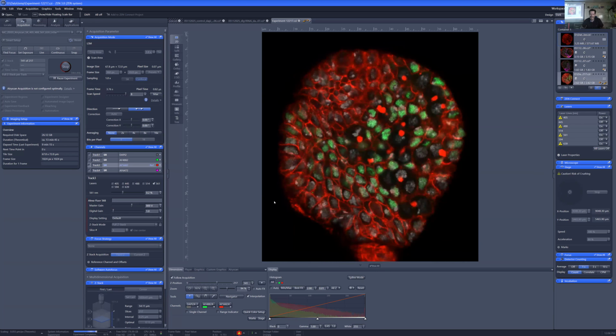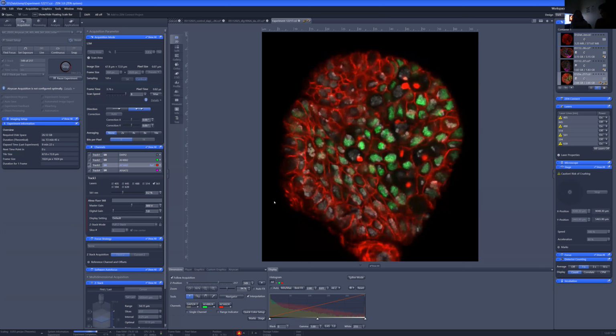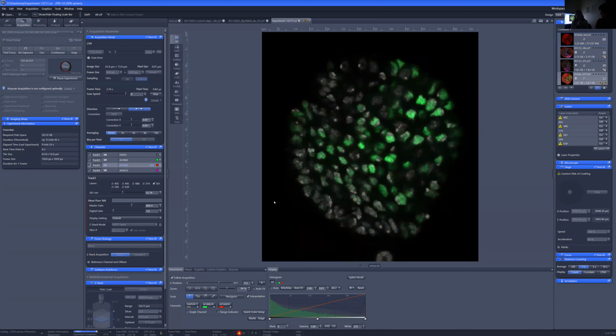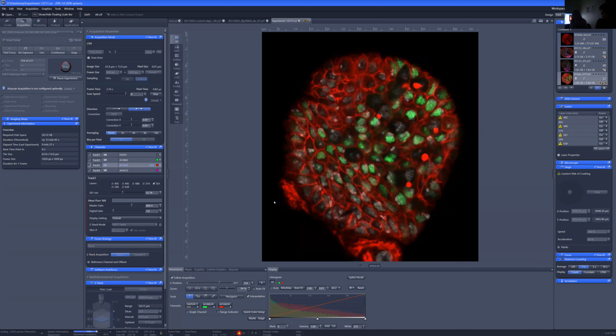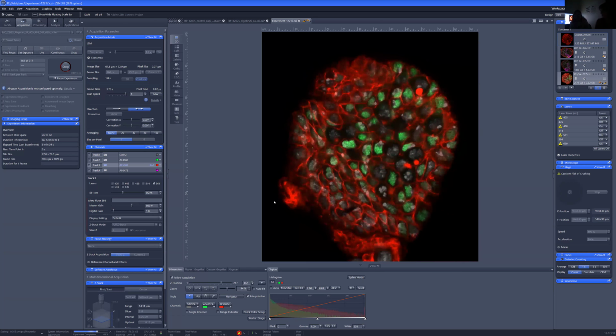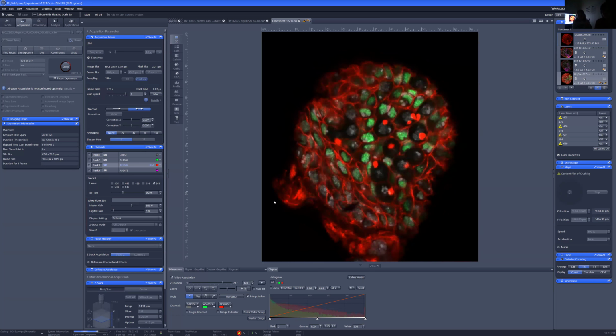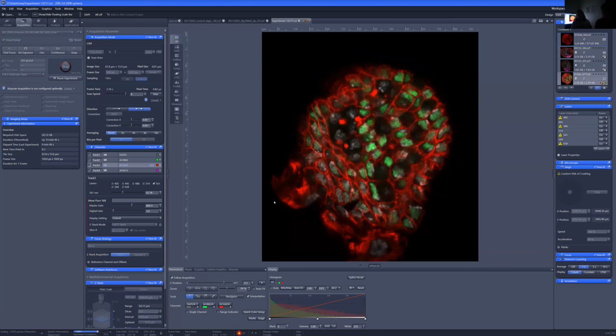Didn't you realize it was because of the temperature of the room or something? It was actually a confluence of a lot of different things. The reason the problem was so hard to fix was because I needed to fix 3 different things before everything would go back to normal. One of them was that when the entire building changed from air conditioning to heat, the temperature of this room accidentally got hard locked at like 65 degrees, which is pretty cold.